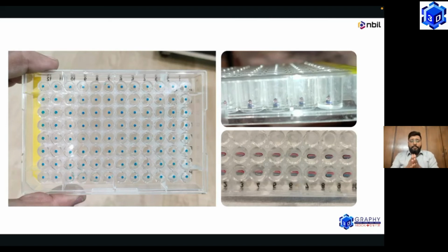And we had to draw a line within the well, and that's something that we were able to do as well after discovering the anti-backlash system here. This project obviously was utilized by Merck for co-culture studies, where they were doing specific studies for tumor models, as well as to understand how they can recreate certain microenvironments and all of that.